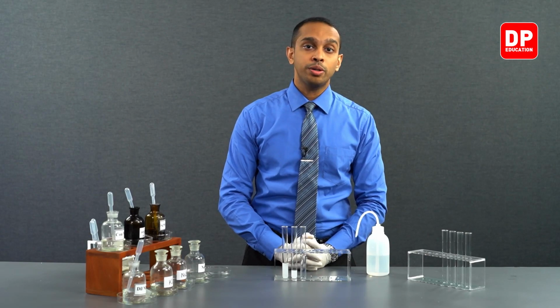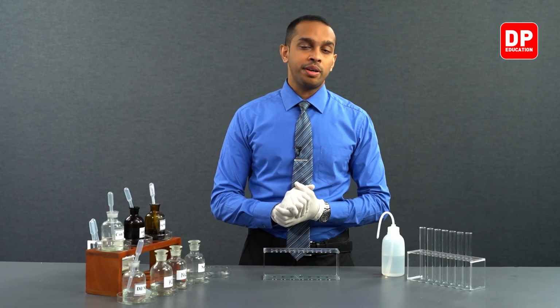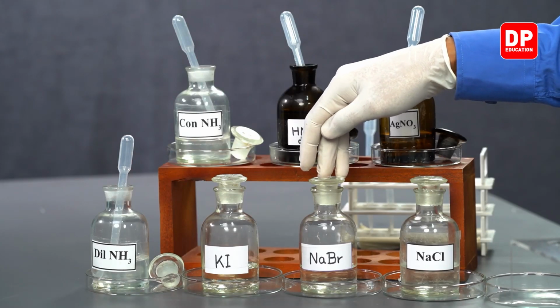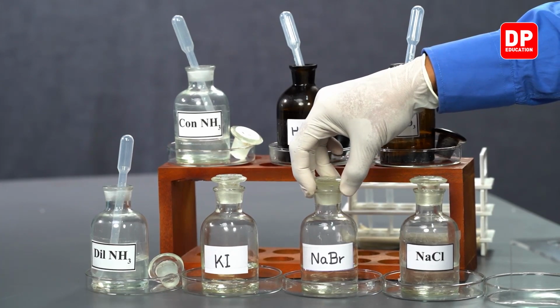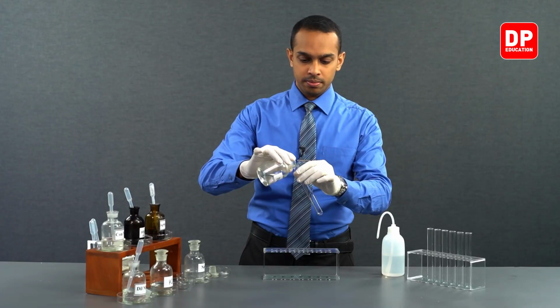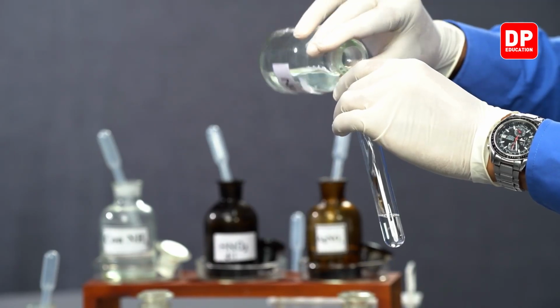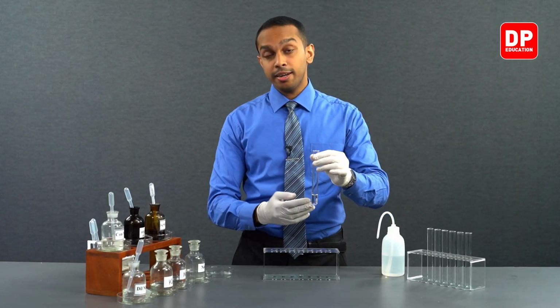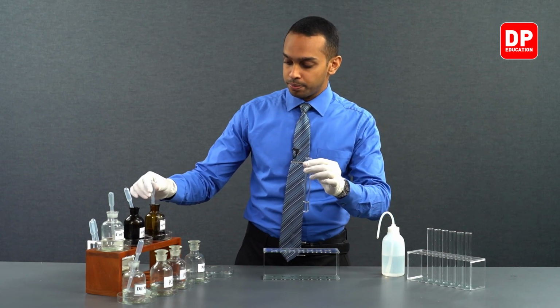Now, let's move on to bromide ions. Let's take a look at how sodium bromide will react with silver nitrate. So, to introduce bromide ions, we have taken sodium bromide solution over here. We'll take a little bit of sodium bromide into a test tube, like so. And into this sodium bromide solution, we will add a little bit of silver nitrate.